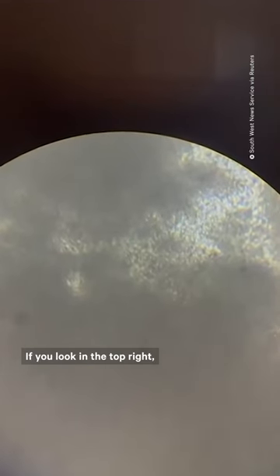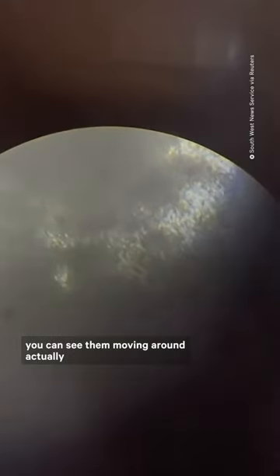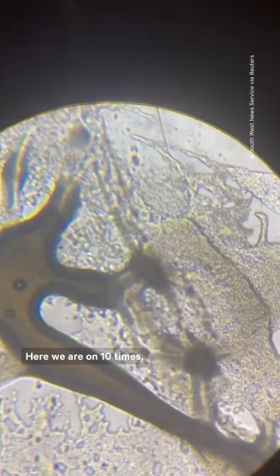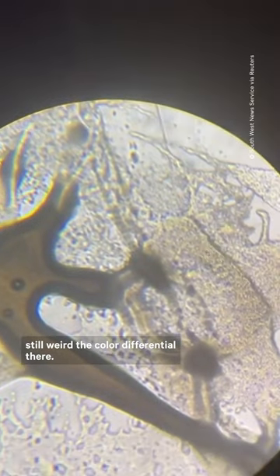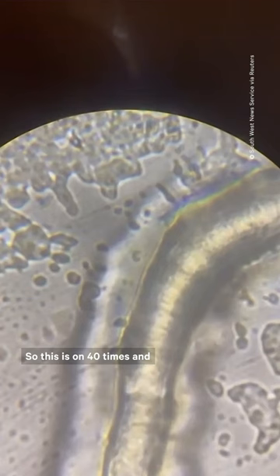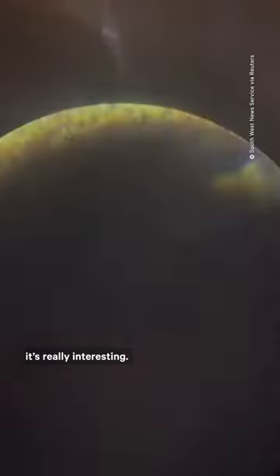Here we go at 40 times magnification. If you look in the top right just a little bit, you can see them moving around, which is pretty cool. Swab all over. Here we are on 10 times. Still weird — the color differential there. We'll get a little more close and see if we can see anything better. So this is on 40 times and it's really interesting.